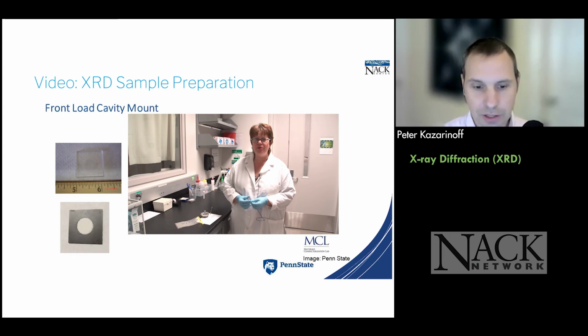So this first video is going to show how to prepare a sample. And this might be something that a technician would do to a sample that they're brought before they put it in the X-ray diffractometer. And in this video, you'll hear from Nicole Wunderling, who is at Penn State, and she's going to talk about how to prepare an X-ray sample.